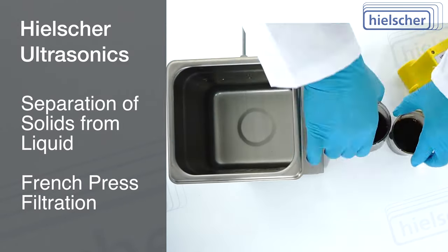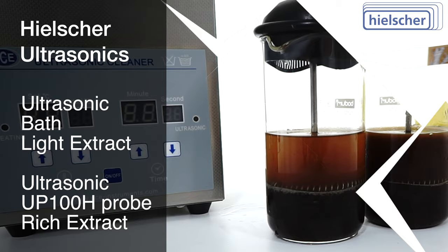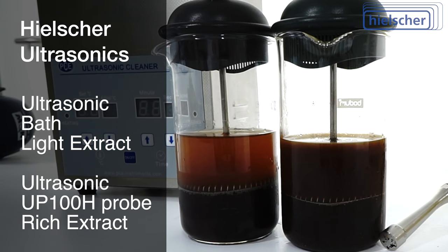After sonication of both beakers is complete, we separate the solids from the liquid using a French press filter. You can see that the extract from the UP100H probe is much darker compared to the extract from the ultrasonic bath.